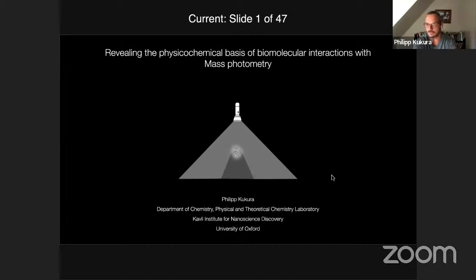And then you could do the same kind of correlation time analysis that you do with fluorescence. So I see no reason why you could not do SCS, right? Sure, scattering correlation spectroscopy. I think if you try to do it label free, that would become quite tricky, because you just don't have a lot of photons. That would be the major challenge: how many photons do you actually get out?